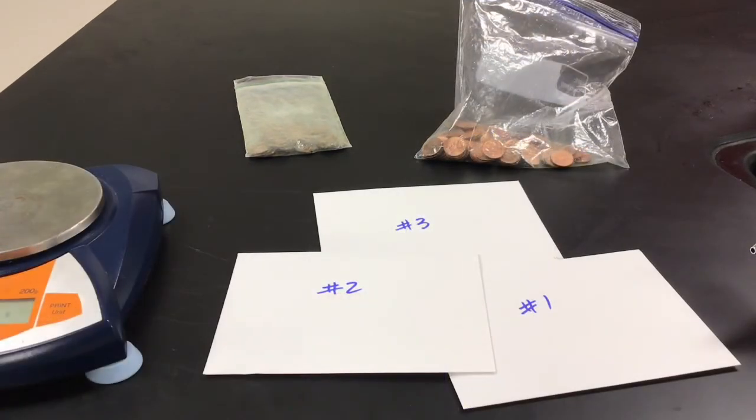Here are the 3 envelopes that you will receive for part C. For each envelope, I placed a total of 10 pennies in there. But at this point, you don't know how many new pennies or how many old pennies are in each different one.